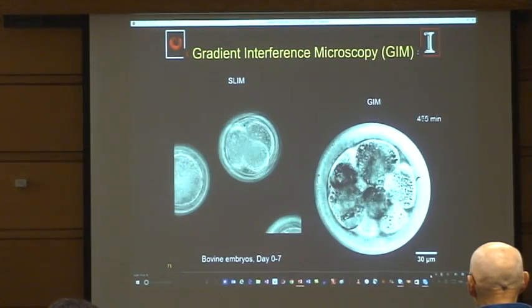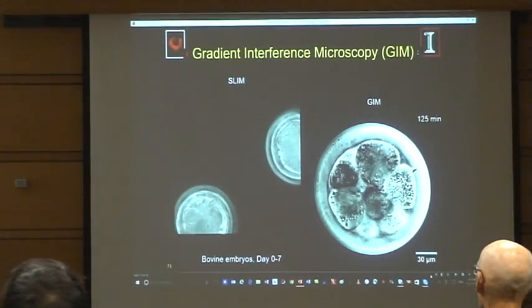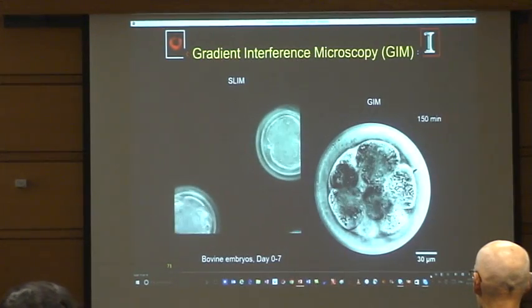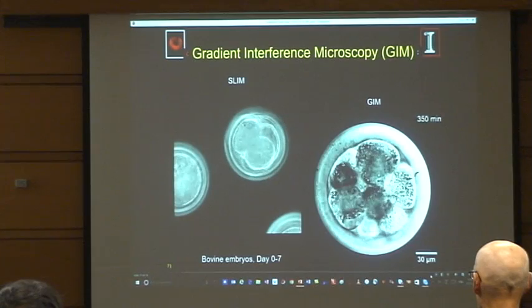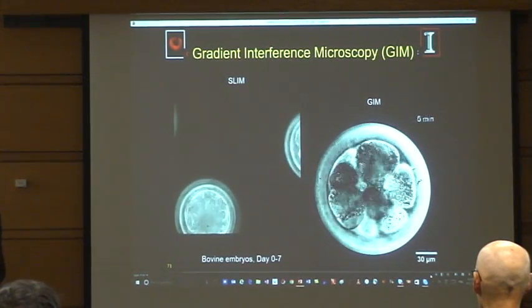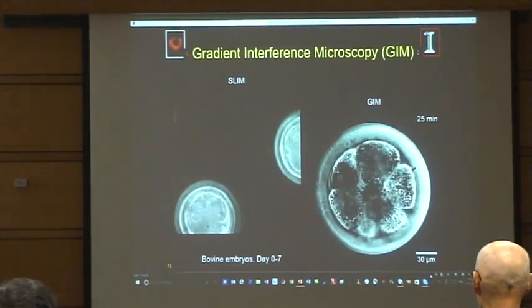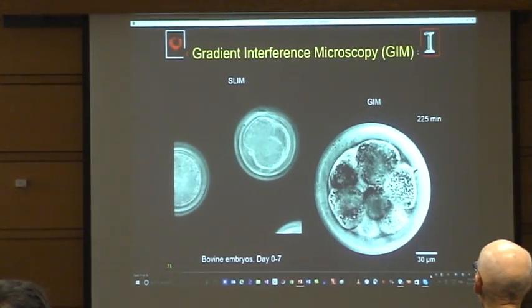So first of all, why is this important? You would like to be able to predict the viability of the embryos. These particular ones are bovine embryos. It's a big problem for cattle breeding and so on. But in vitro fertilization is actually, I think, becoming more and more important for us humans as well. So it would be nice to, instead of implanting 8 embryos and ending up with octuplets sometimes, be very predictive about it. So find signatures that are actually predictive of viability.